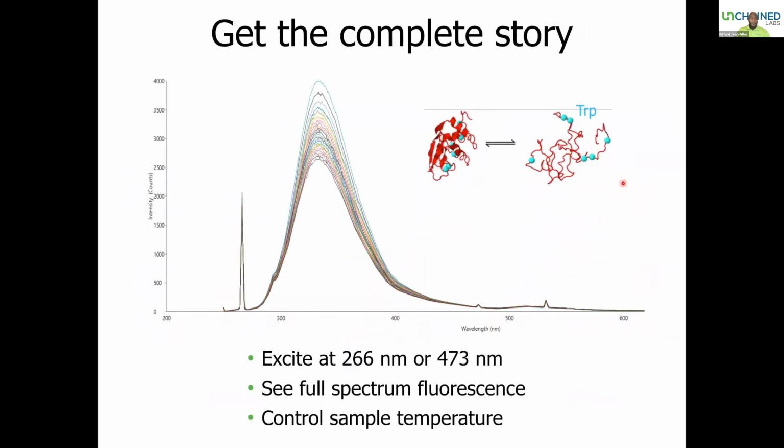So this is the raw data showing an animation and the actual change in the raw spectrum for a protein. This is typically collected in the example here at a relatively low concentration. So let's say at about 1 to 10 milligram per ml. And the reason why I'm doing so is because I want you to really take a look at the appearance of this curve here, right? And to see exactly how it looks as it undergoes unfolding and denaturation. You have this very nice decrease in the intensity and a slight redshift that happens as your protein unfolds, which is characteristic of the opening, right, or the denaturation of the tertiary structure.